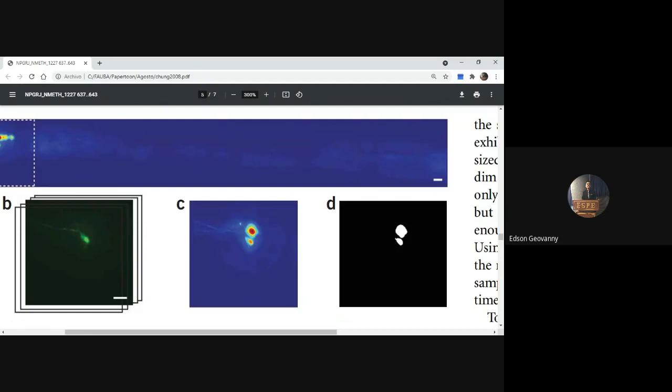And the conclusion: this chip is used with two different modes, made through a photolithography process to create the worm loading layer and the control layer. And this system is independent of the microscope, and the camera is compatible with all typical microscopy configurations, such as a simple microscope or a stereoscope.